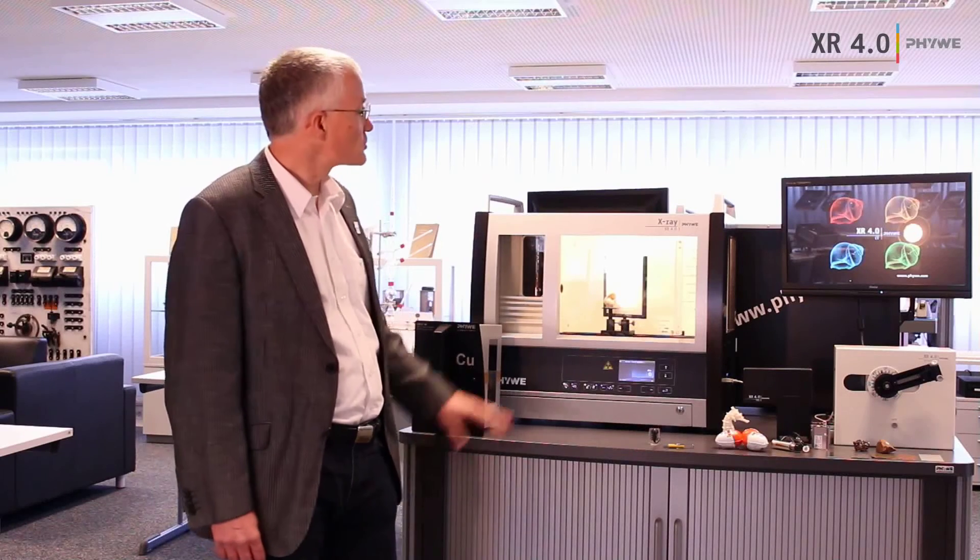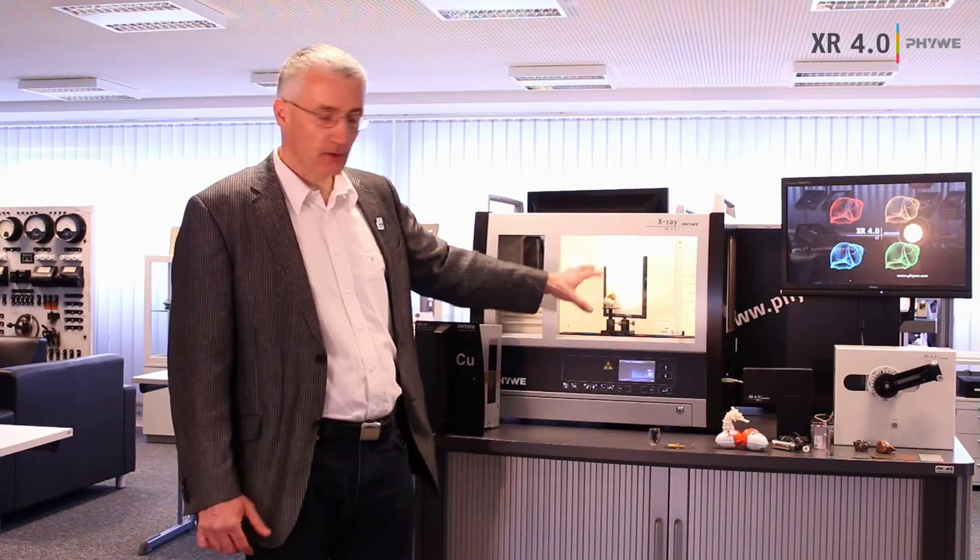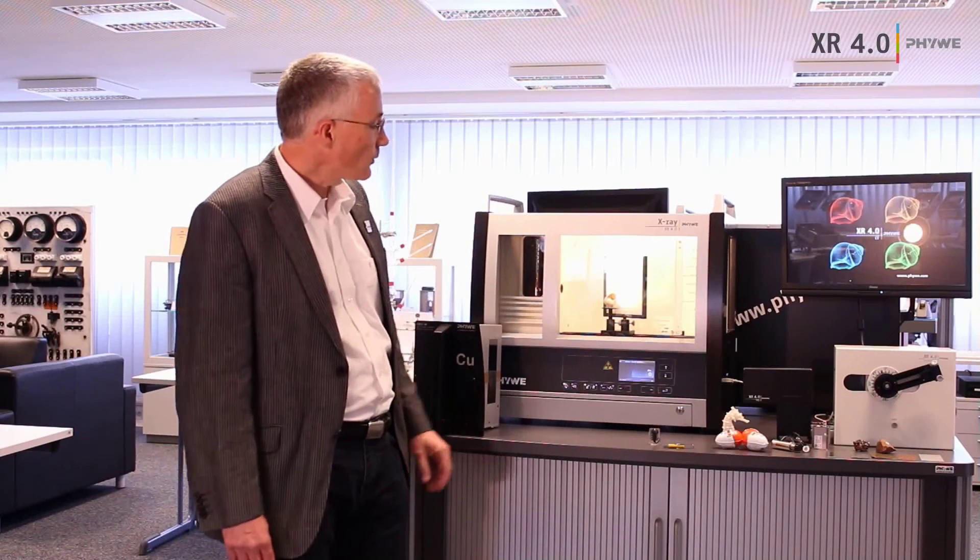We have a lot of different accessories so that you can run 56 different experiments. One experiment shown here is a radiography of a biological sample, but you can also use material samples like a USB stick, or if you are very curious you can look inside a chocolate egg to see if there's something in it.